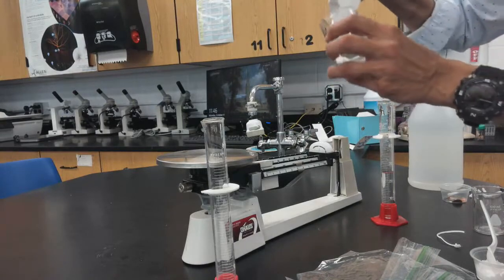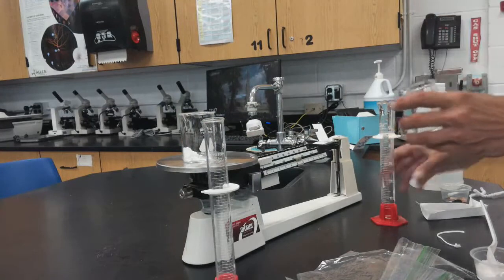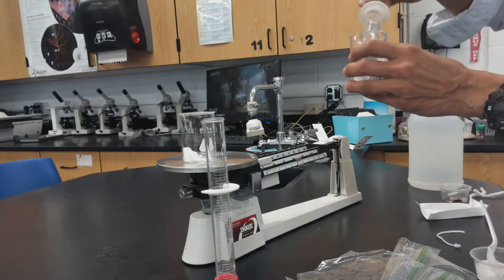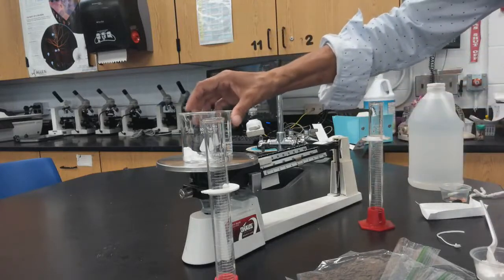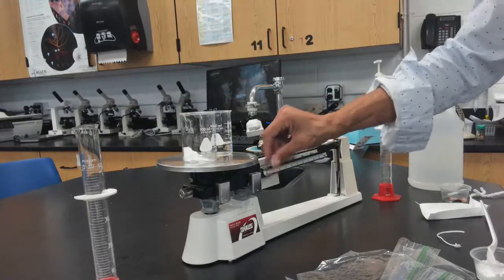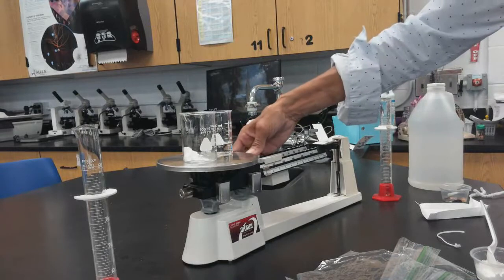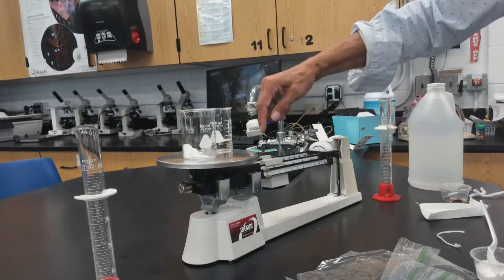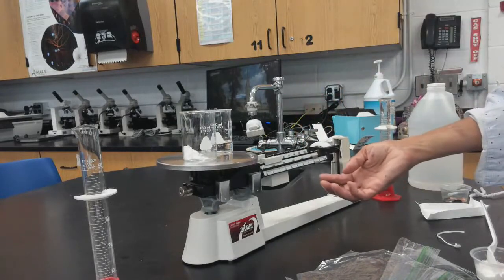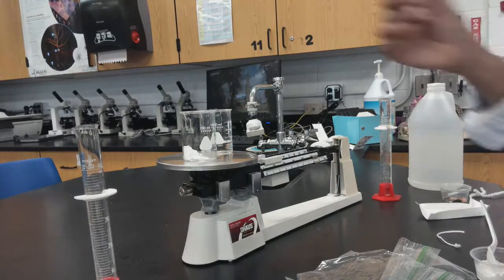Put the sodium bicarbonate into a beaker. Take another beaker and add 50 milliliters of acetic acid, which is vinegar. Both beakers need to be on the scale together, and you're going to record the mass. This reads 128.3 grams — make sure you record that.